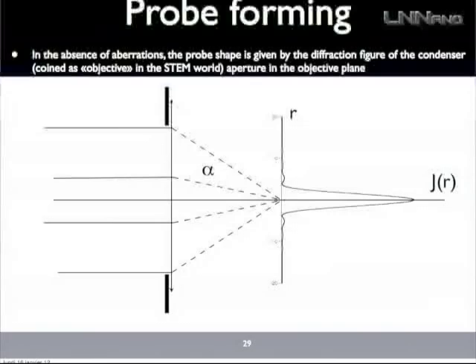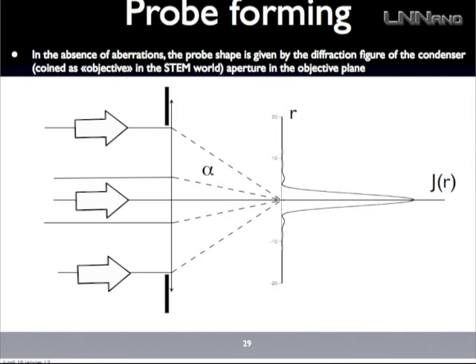Okay, so this is still this basic STEM I was discussing at the beginning. Now it's on the side, I'm sorry for that. It's on the side because I just wanted to make it just like an optics system with photons. So it's very simple. Your gun is somewhere very, very far away, and you have one condenser which collimates the beam, so makes it parallel.